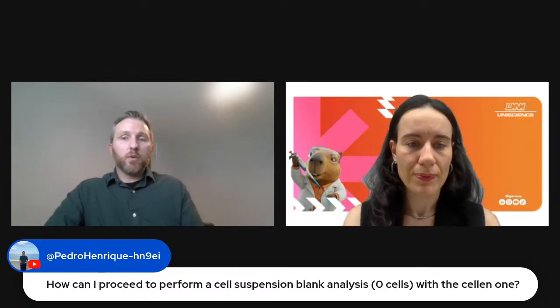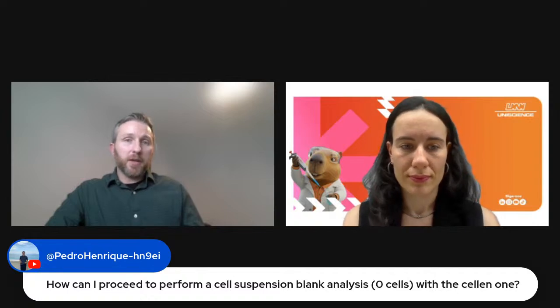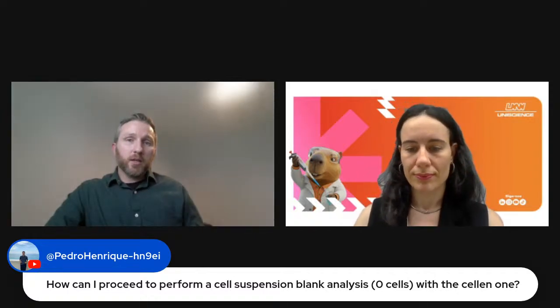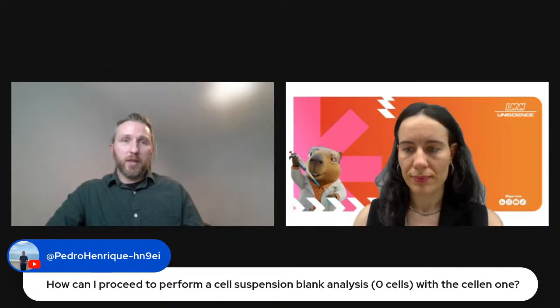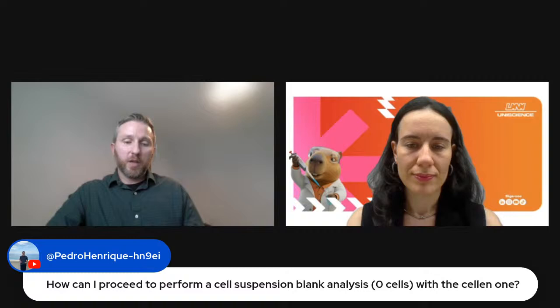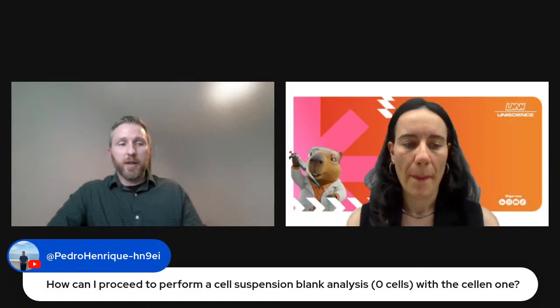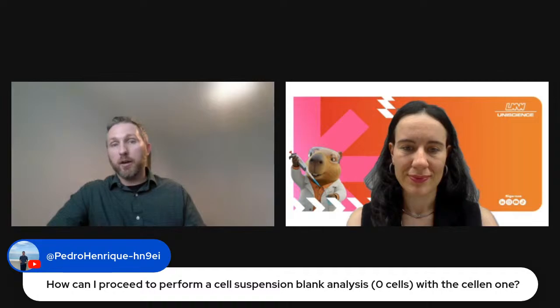So what I would recommend for the blank analysis would be aspirating some of your media, whatever it is that you're suspending your cells in, and then you can tell the system, just like you can do reagent dispensing, to drop a single droplet of that cell media into the locations that you want to be a blank. Effectively, a negative control can be one where you just choose not to isolate a cell into it, but if you want to be even more accurate, you can intentionally dispense a single droplet of your solution that does not contain a cell.